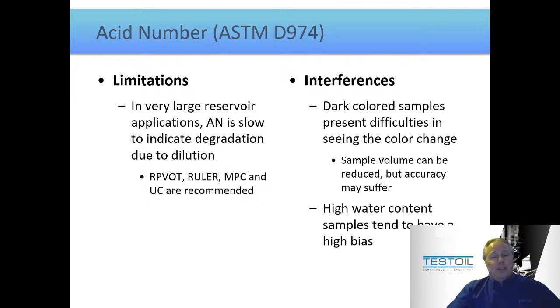Interferences to this test, though, is water content. High degrees of moisture in your oil not only promote the formation of acids just in service, but can impact formation of acids during testing, meaning sometimes we will report a higher than expected acid number because acids have formed while the test was being run. My simple logic to a worry or concern like that is if your water content is high enough to mess up the results of this test, there's your problem. You have too much water in your oil, and that should be your focus more so than what your acid number is doing at this exact moment in time.